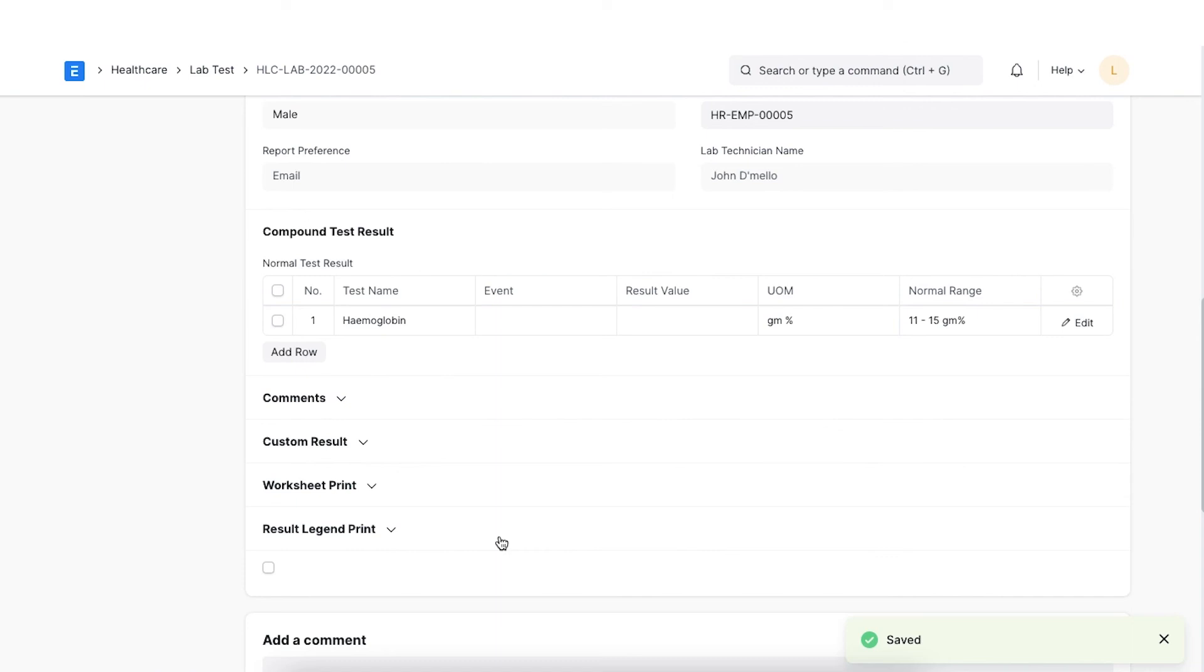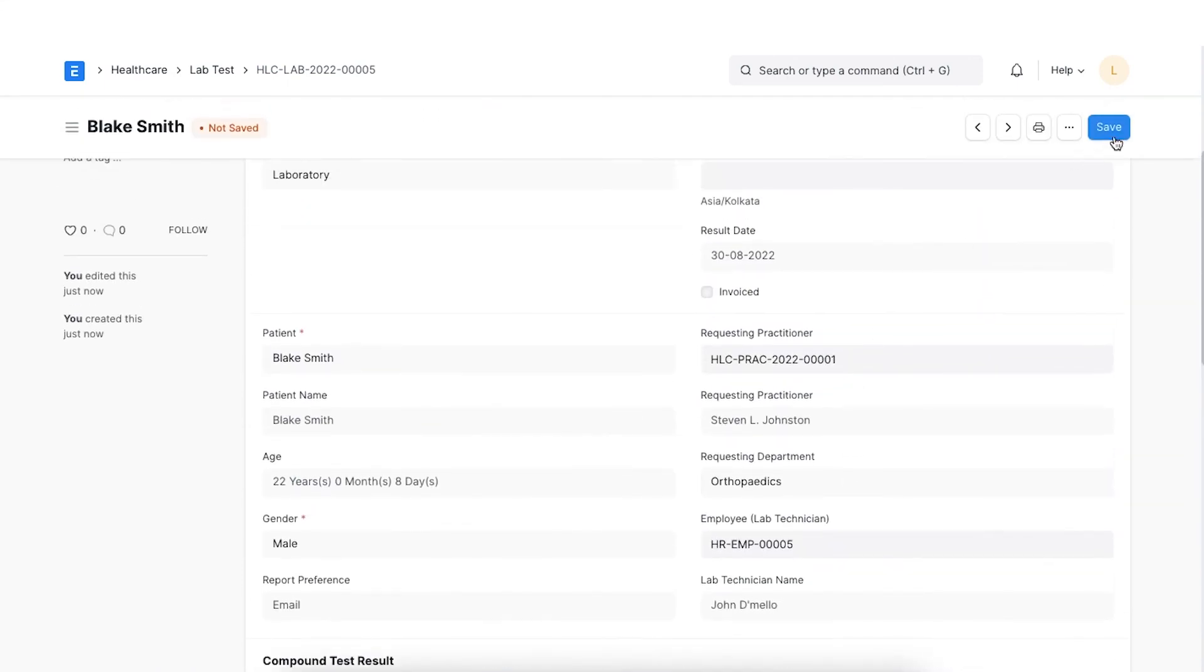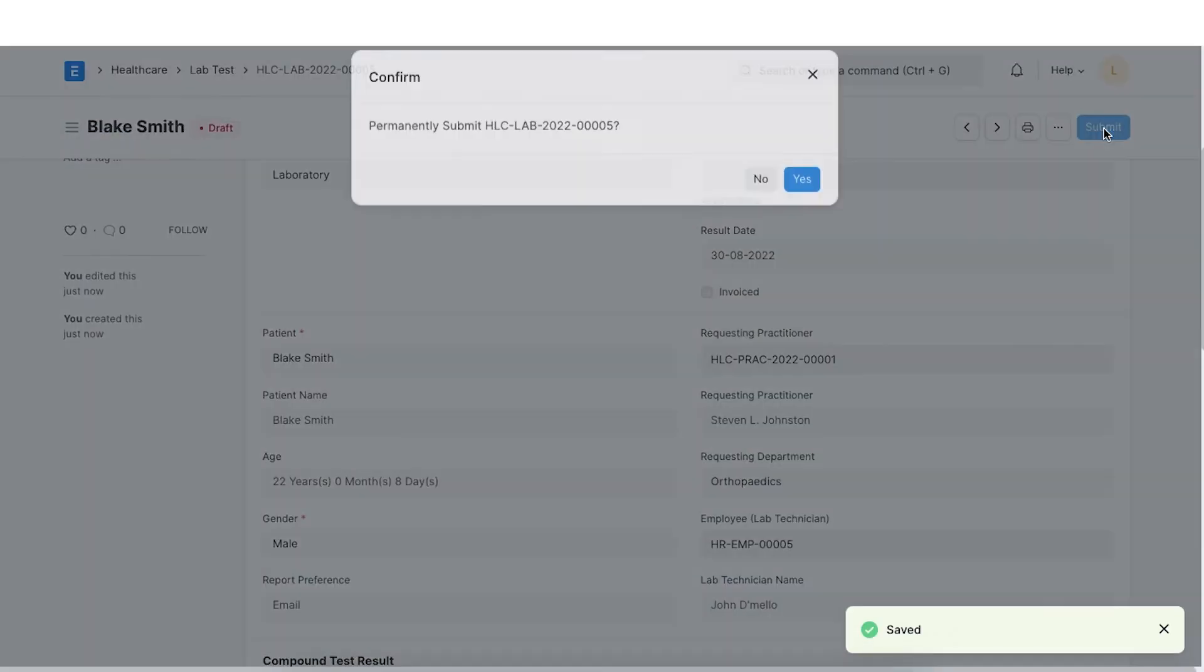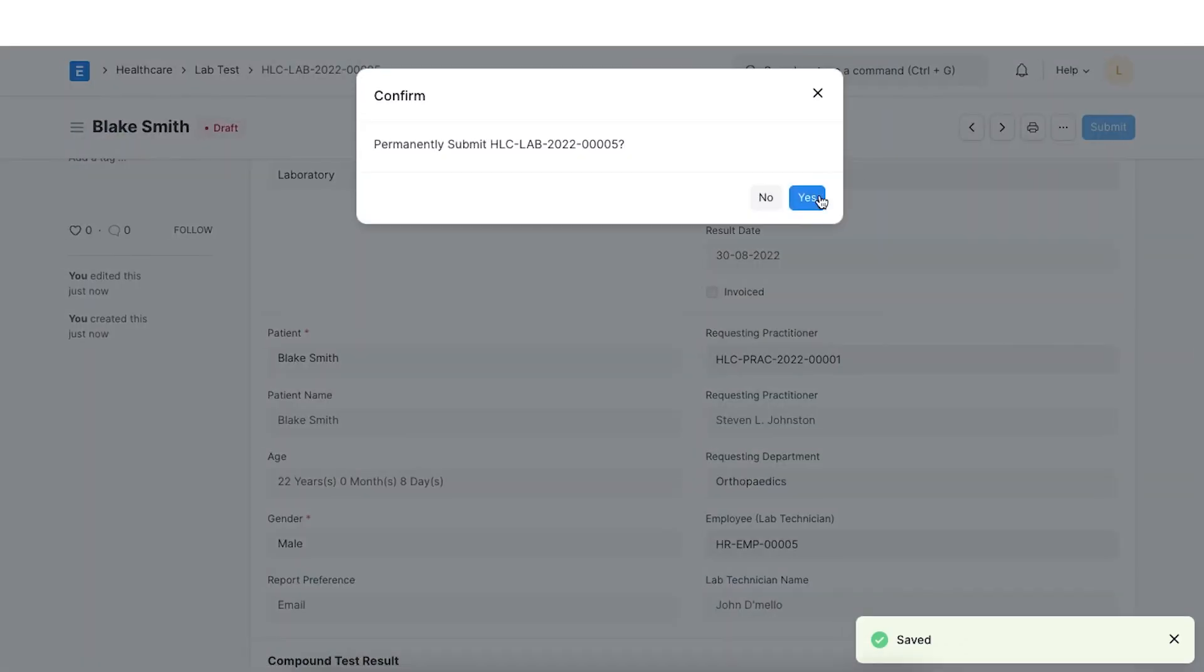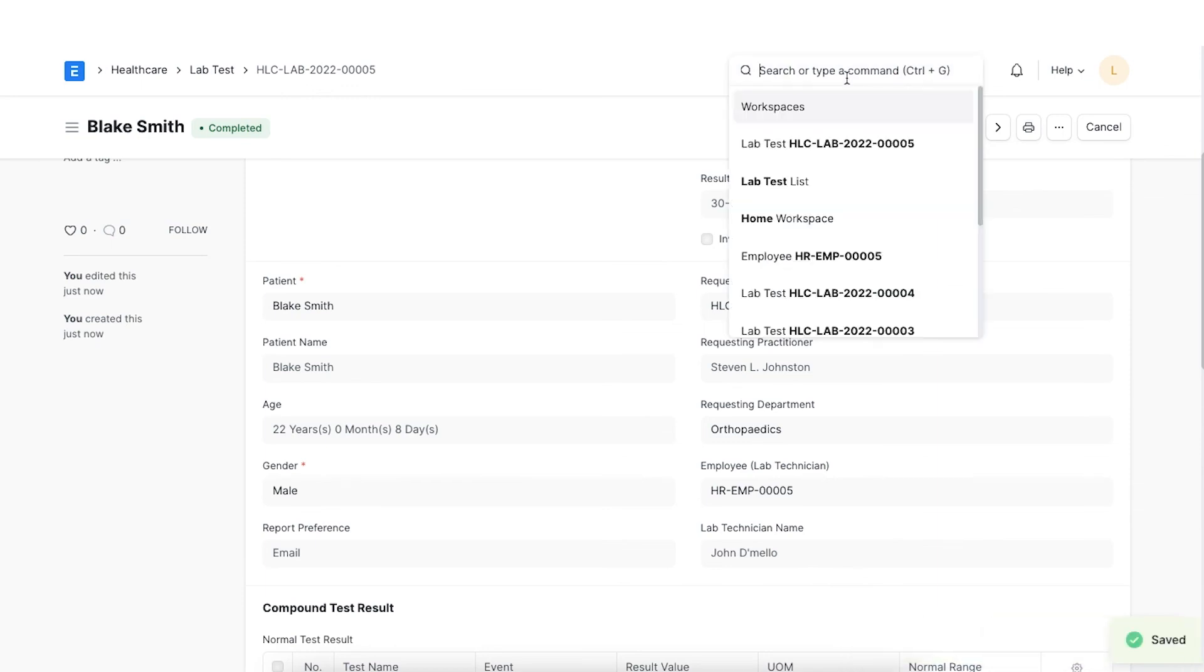As the report gets ready, you can enter the details of the results in the lab test document. Once submitted, we can send an SMS or email to the patient to share their results. For this, we must set up SMS settings.